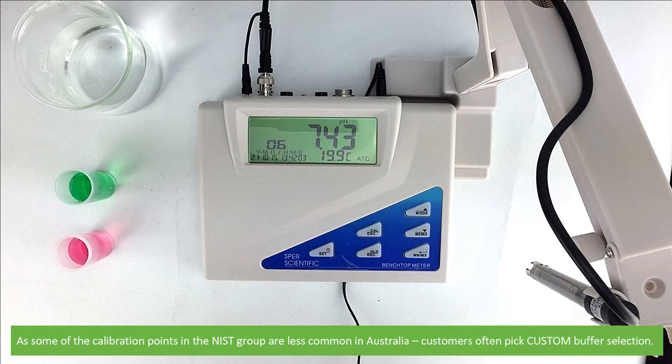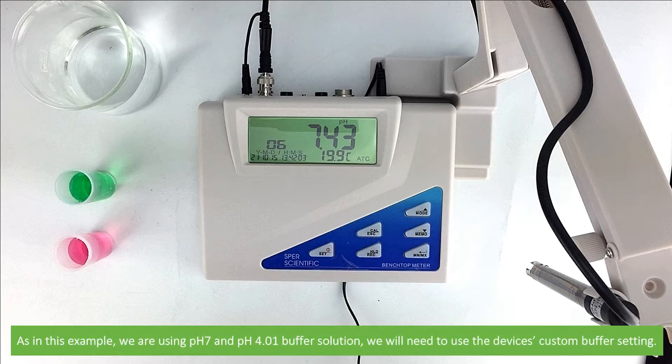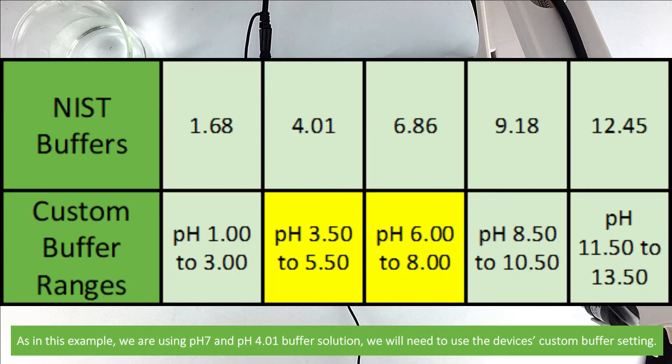As some of the calibration points in the NIST group are less common in Australia, customers often pick custom buffer selection. As in this example, we're using pH 7 and pH 4.01 buffer solution, we'll need to use the device's custom buffer setting.